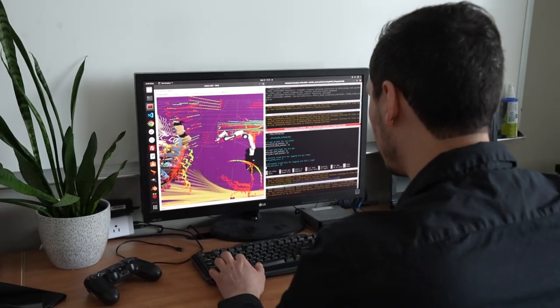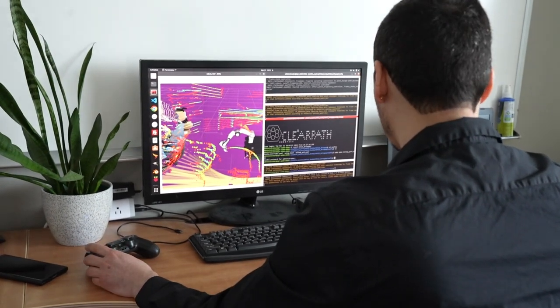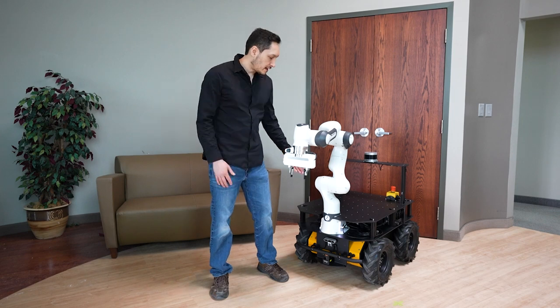This robot is intended for cutting-edge AI and robotic research. Let me give you a quick walkthrough of all the components I've added.